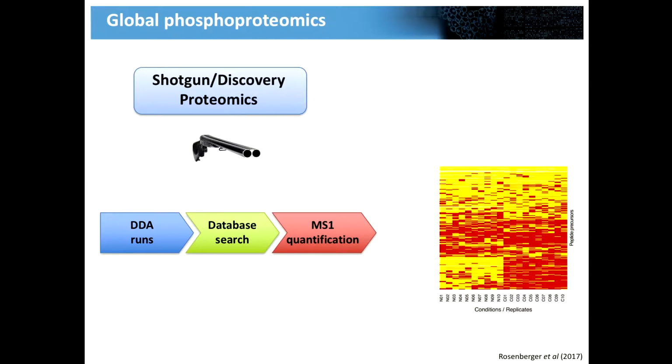How many people here have run a phosphoproteome experiment? So most of you, great. People are usually doing it with DDA? Most of you. So you are probably familiar with these types of heat maps.